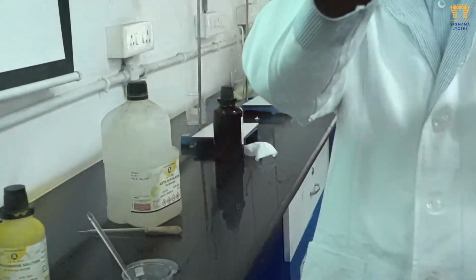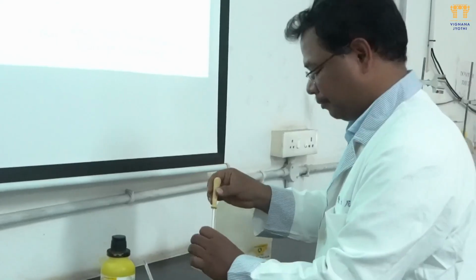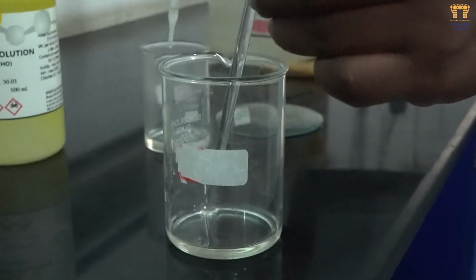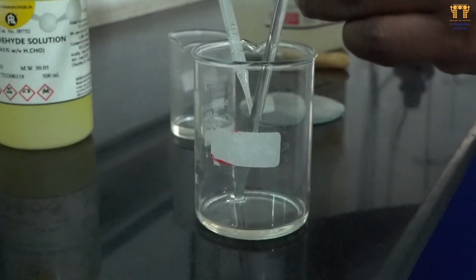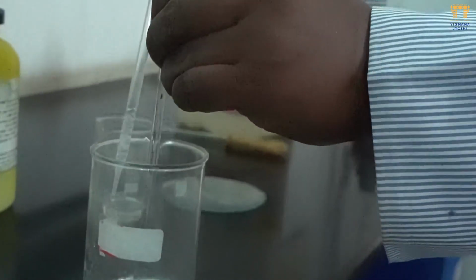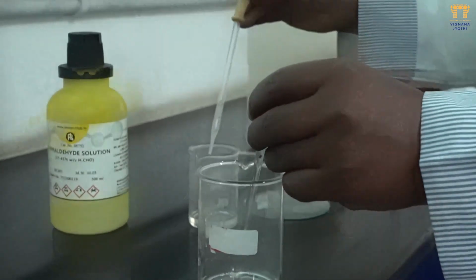Then add concentrated HCl, 1 to 2 ml. With the help of the dropper, you can add the concentrated HCl into the beaker through the walls of the beaker, or with the help of the glass rod, putting the concentrated HCl solution on the glass rod or walls of the beaker. Since the reaction is exothermic, we should be very careful while adding the HCl solution. We have to stir properly.